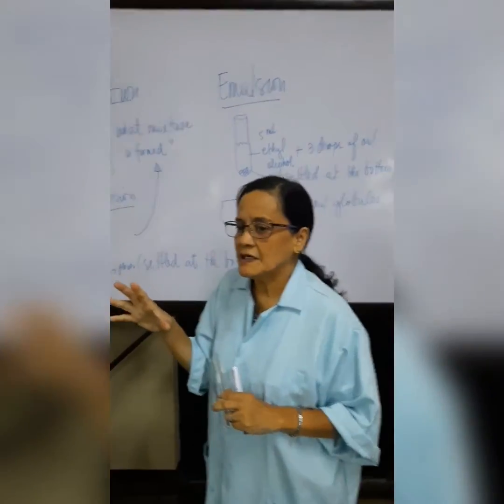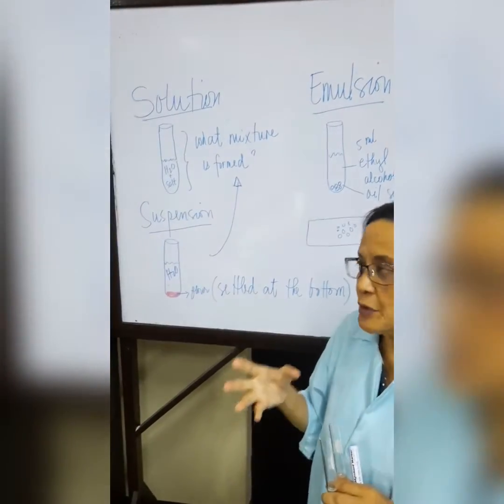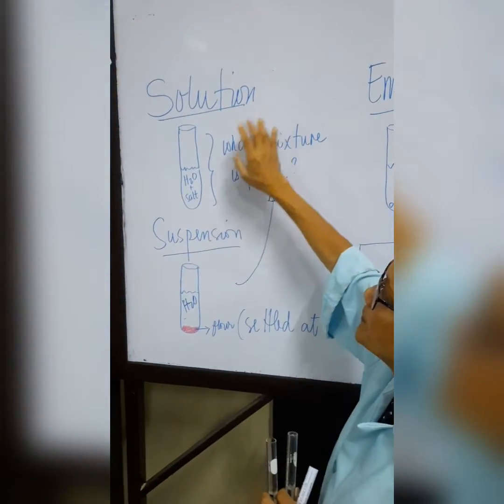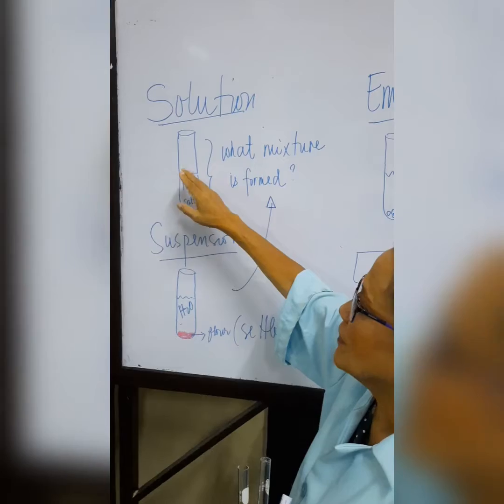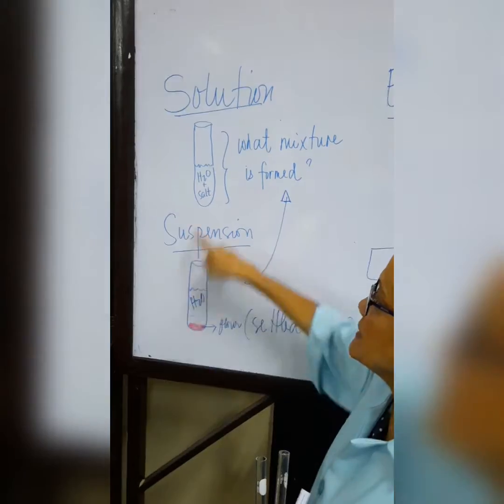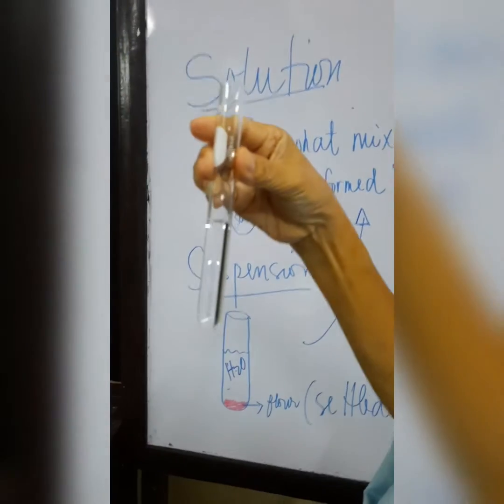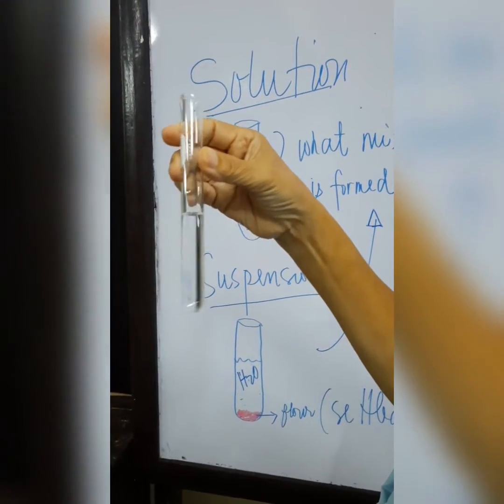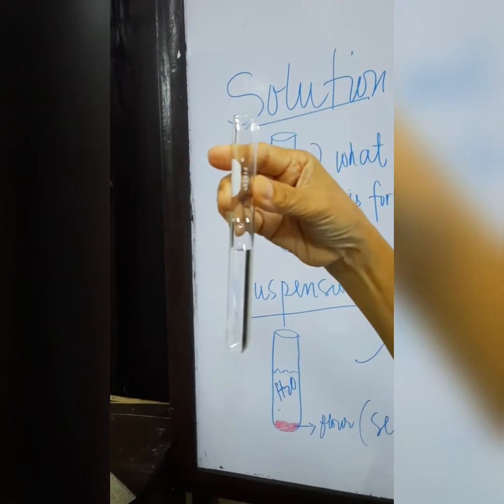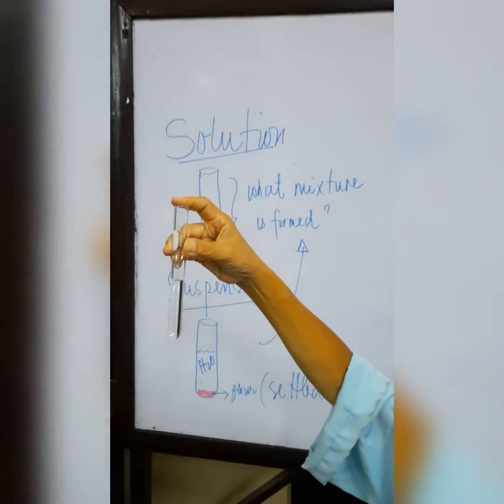These are some of the several tests that we did in order to know the properties of protoplasm. So we have here the dispersal system, in which we added half-filled water and added the salt. So this is the result. Okay, so what happened here? Did you still see the solute? Okay, so again, what mixture is being formed in here?